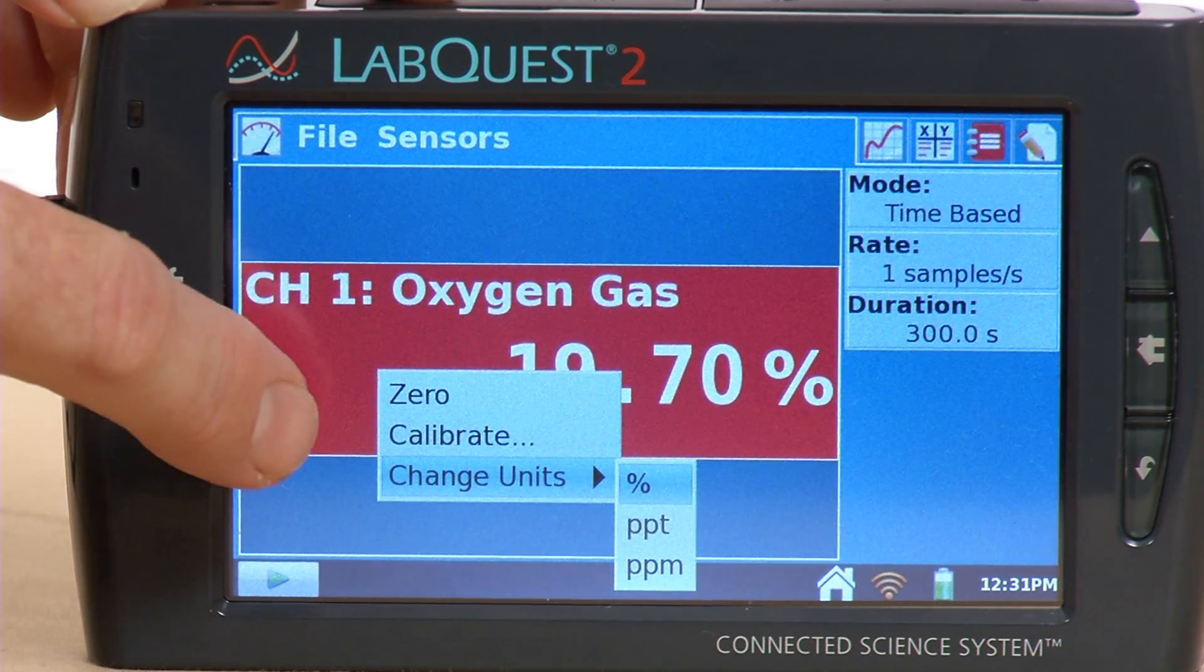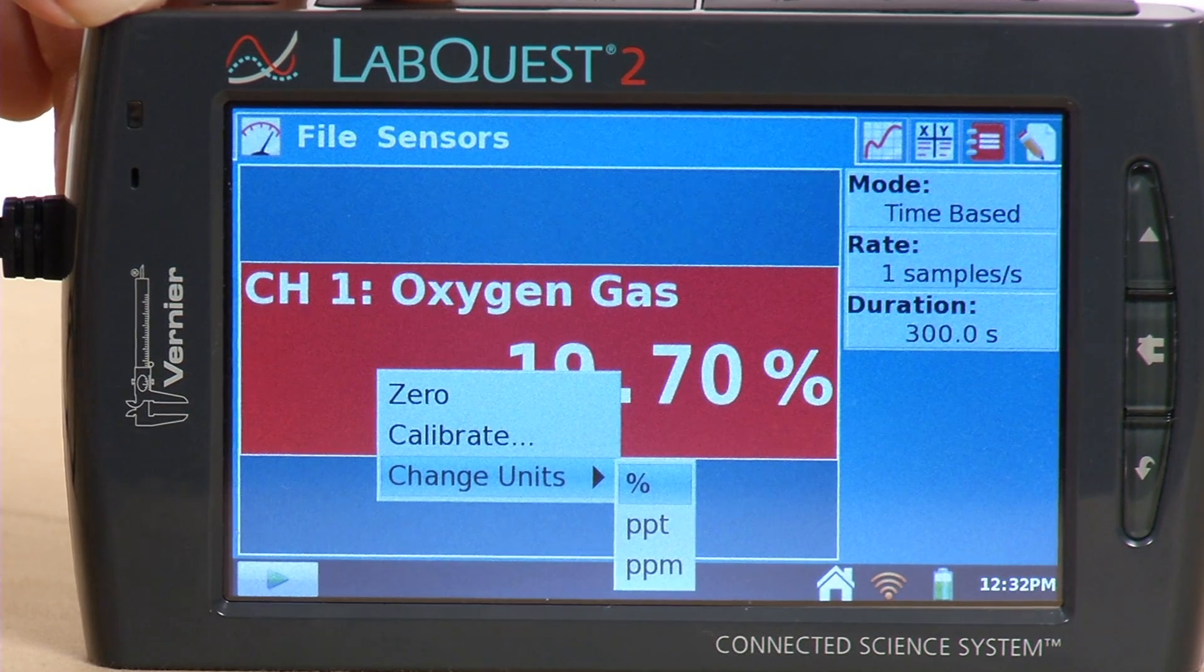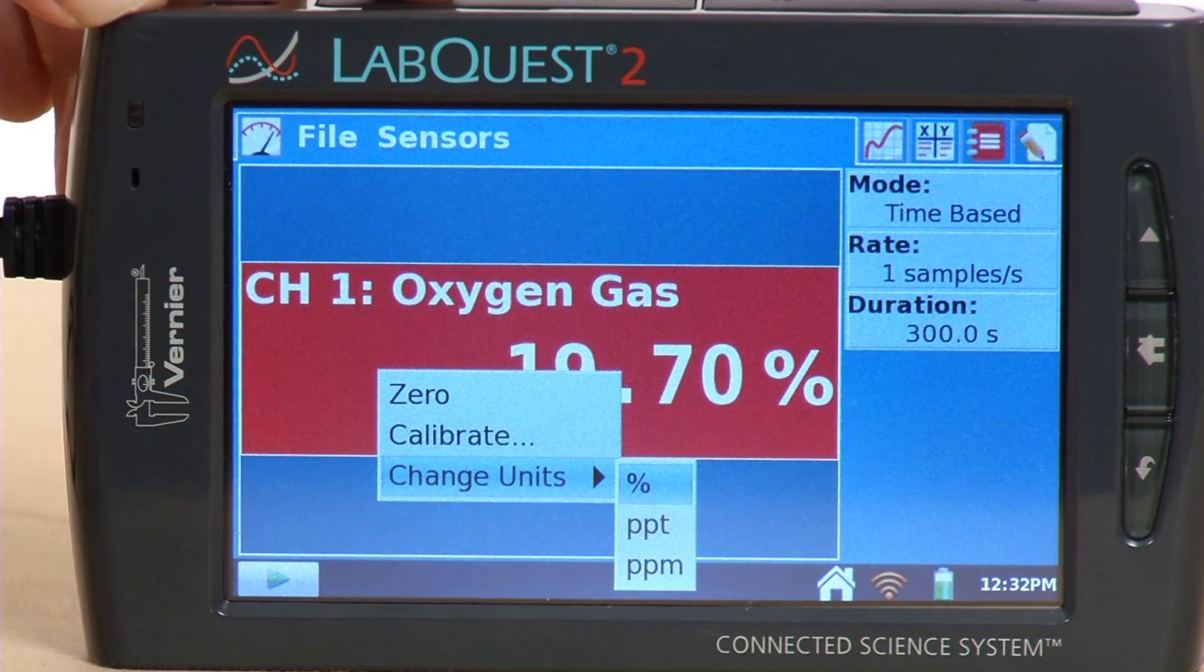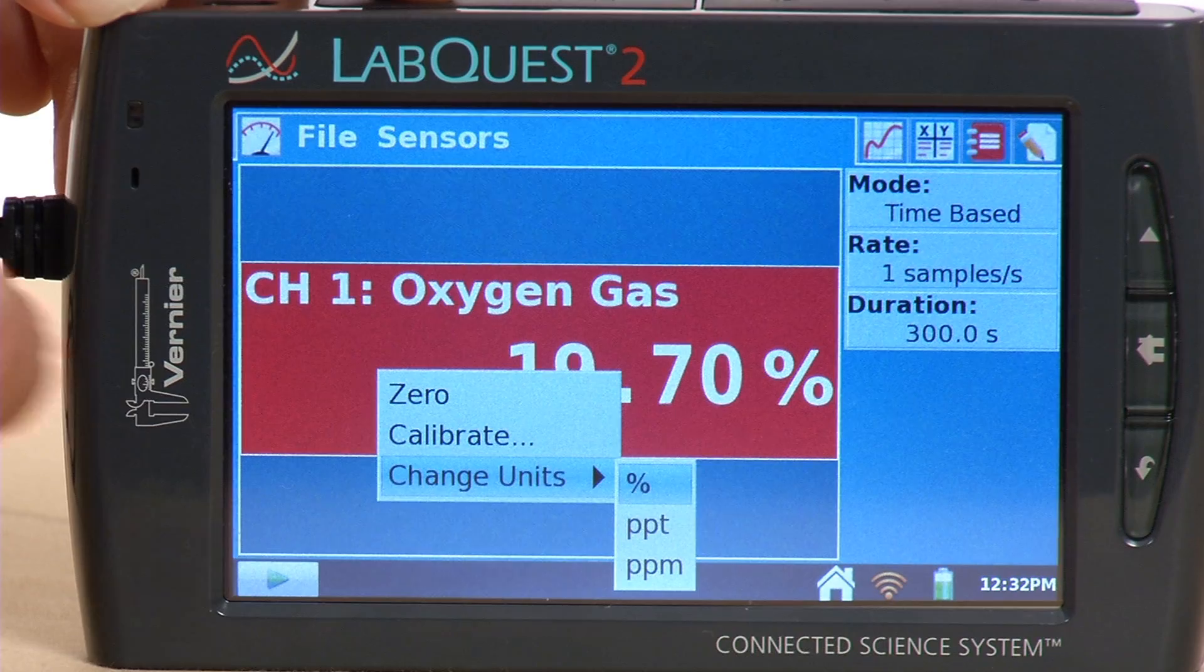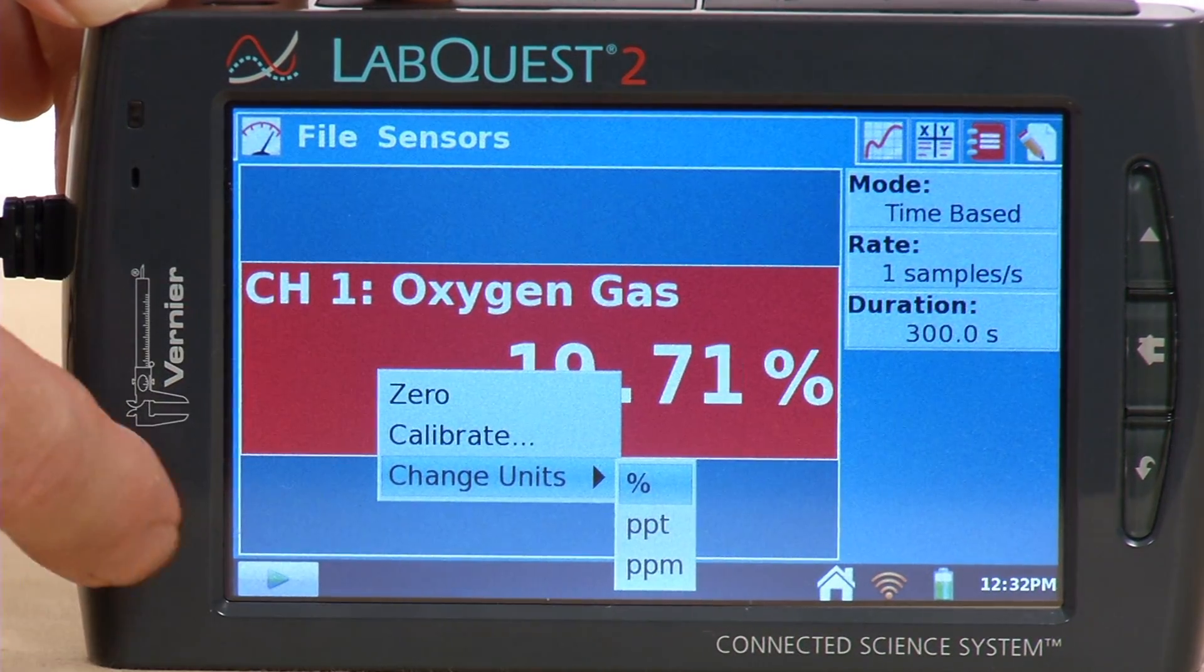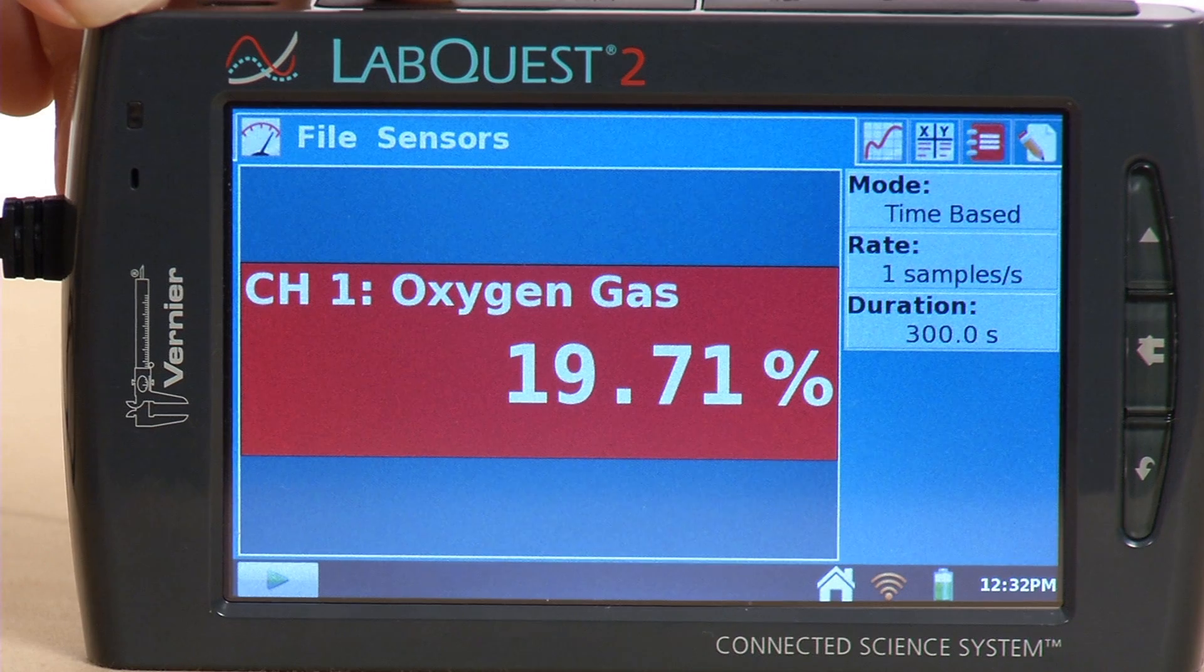We have another option there. You can zero it. So you could have it read just the change in the oxygen value if you wanted to, or the calibration that you possibly could do if you wanted to. But we'll just leave that the way it is.